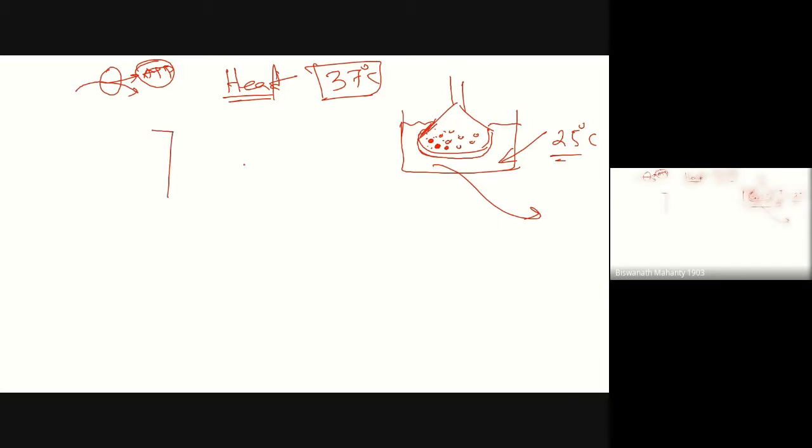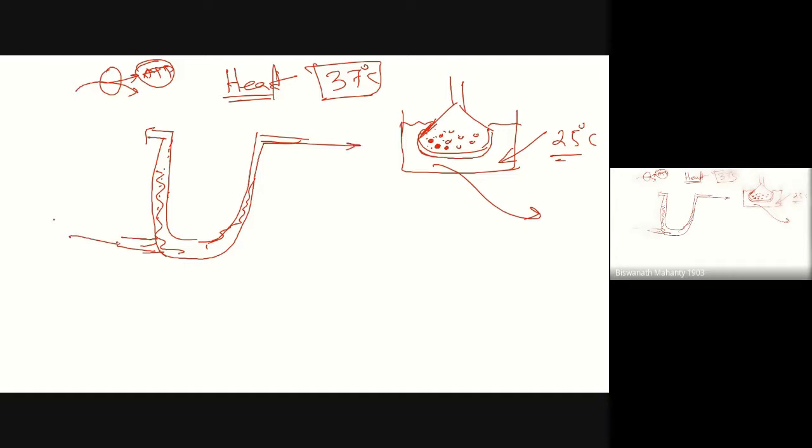When I am having a big fermenter, we can have a cooling water system. So for example, this is one jacket. There will be two entries at the bottom. Water will come inside. This is inside glass, and this is empty space. It is locked, for example. So water will come and fill up the whole surrounding, and finally it will come out. So you are allowing cool, chilled water, and this is your culture broth, right? So for example, this is culture broth. What will happen? Across the glass boundary, heat transfer will take place. So your culture will become a little cool, and the cool water will become hot. So heat exchange is required.